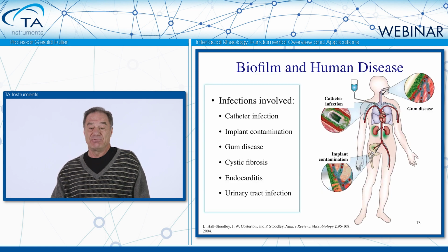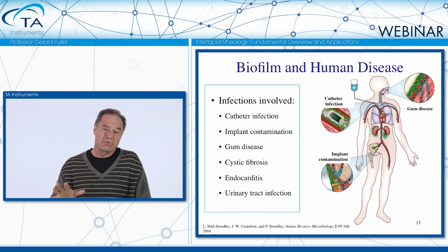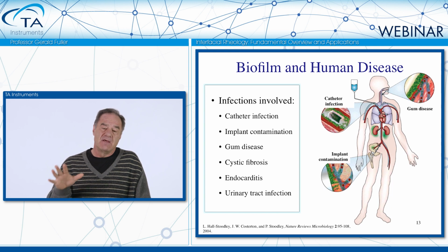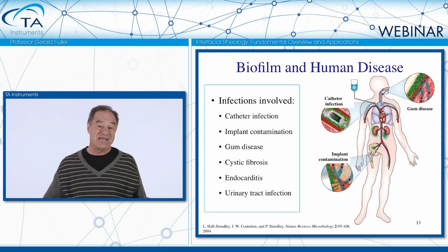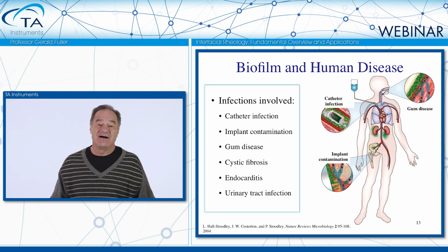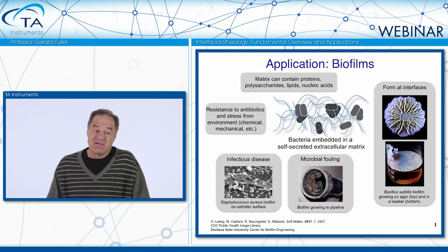Now we're going to go into applications. So again, I invite you to look at the earlier webinar where we go into a lot more detail about background on capillarity, for example. I'm going to go into 4 different applications. The first one has to do with biofilms. And these, again, are around us. They're actually inside us, unfortunately, because they're associated with infectious disease.